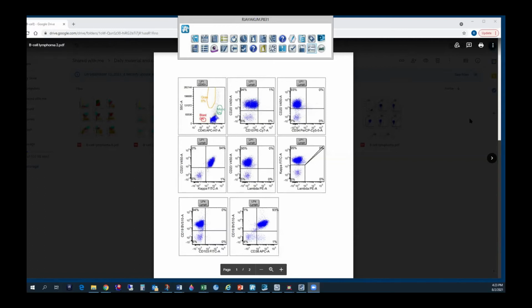While I was at Hopkins, we never gave percentages for anything except the blast percentage, or what percent of cells are monotypic or monoclonal, or what percent of T cells are LGLs, or what percent of T cells show loss of CD26 in a cutaneous T cell lymphoma.